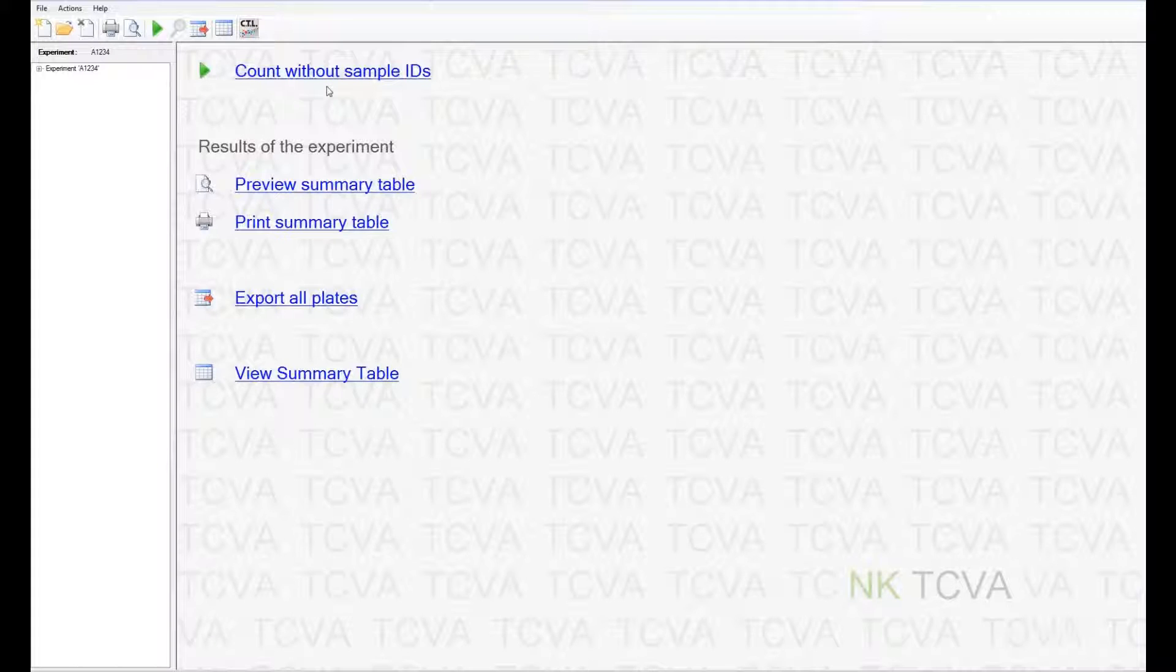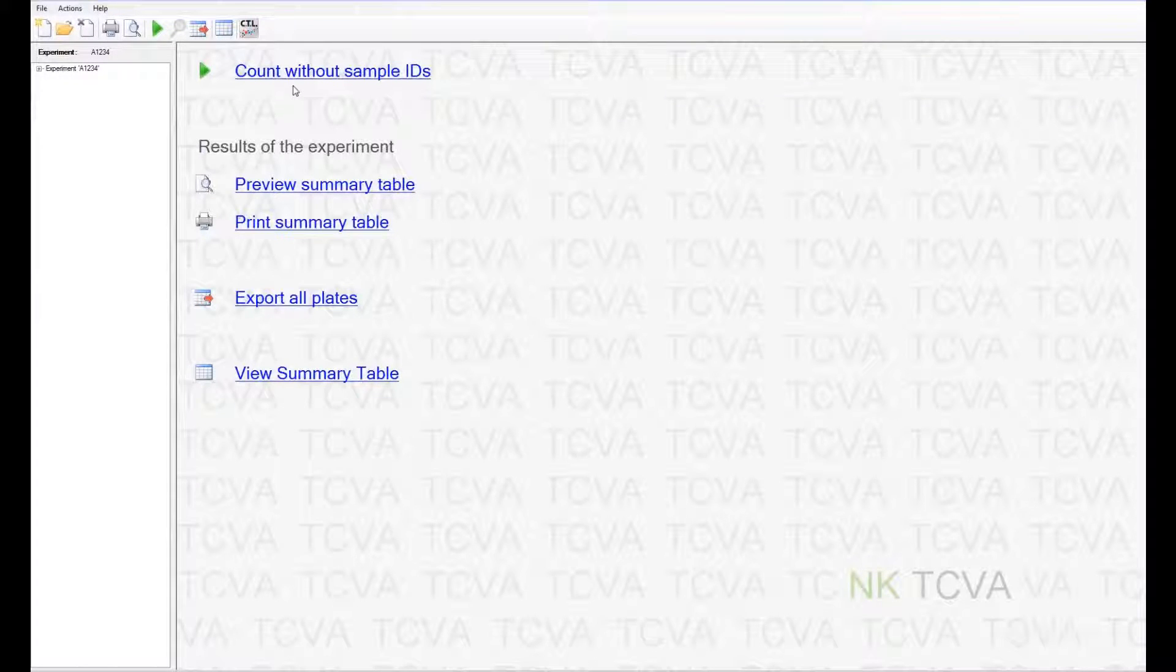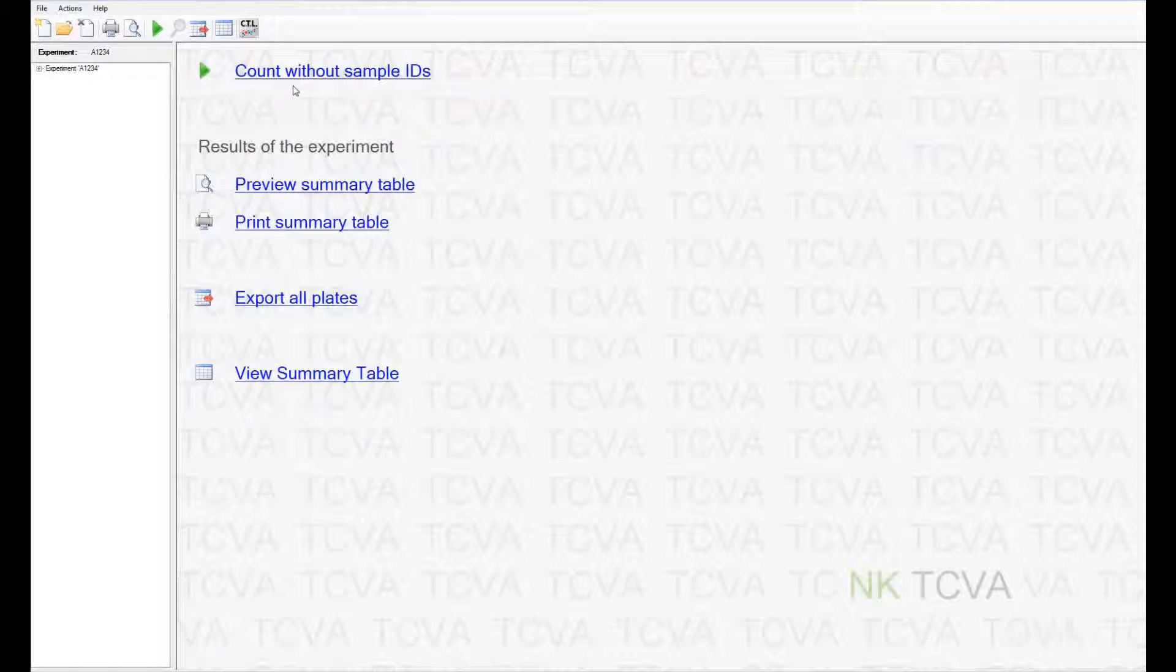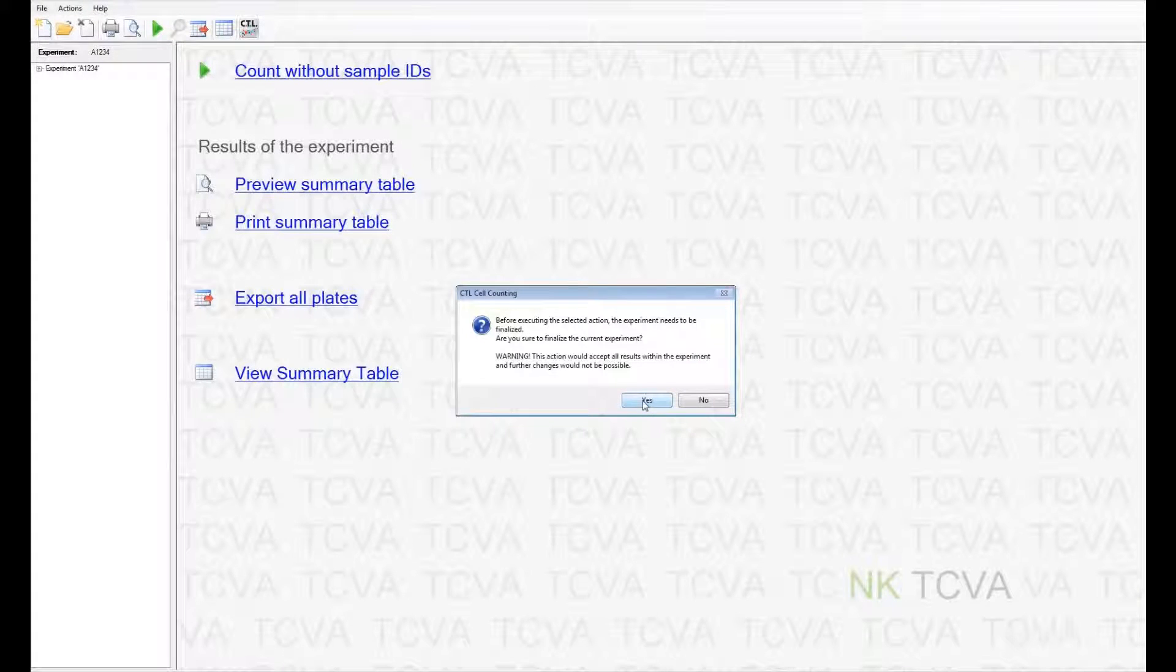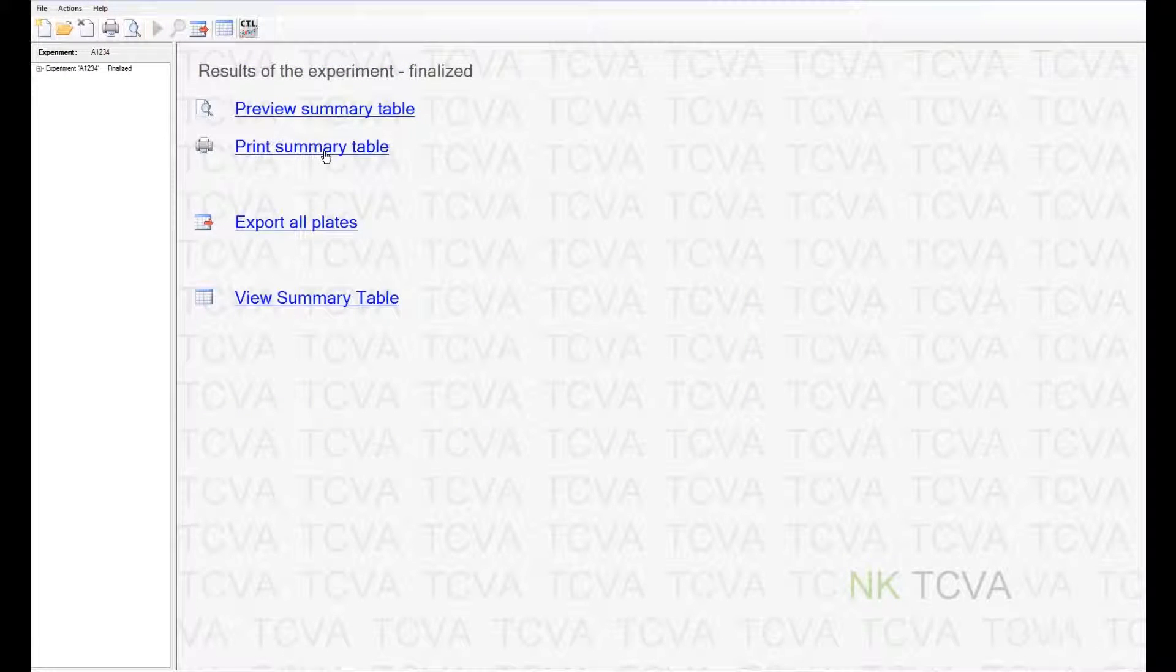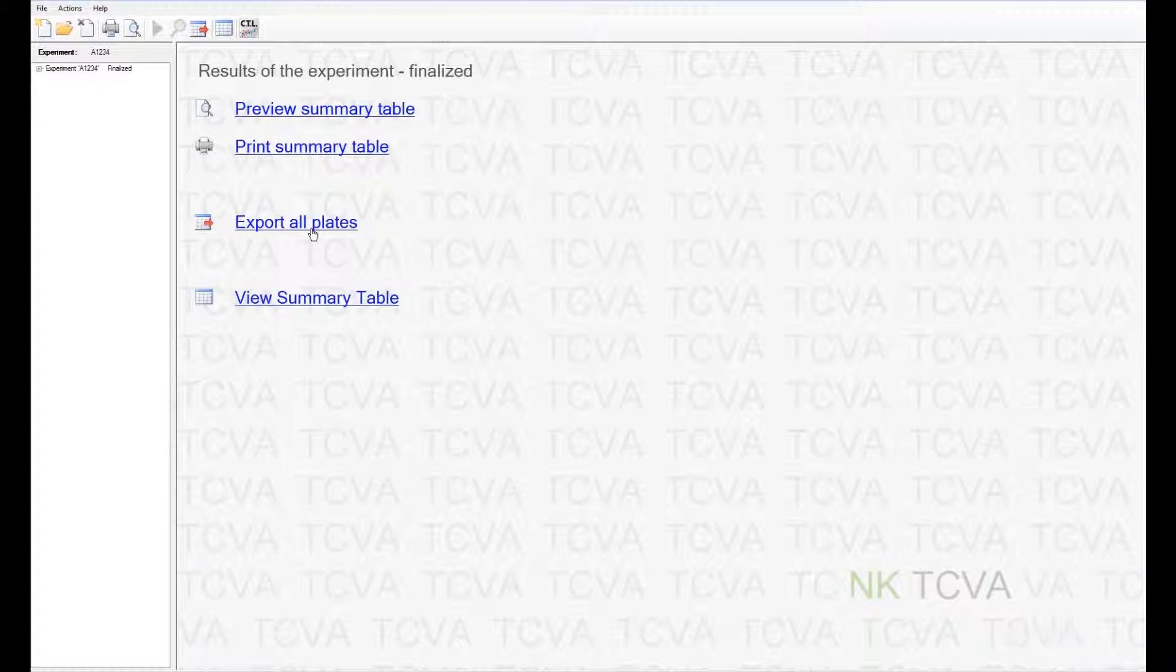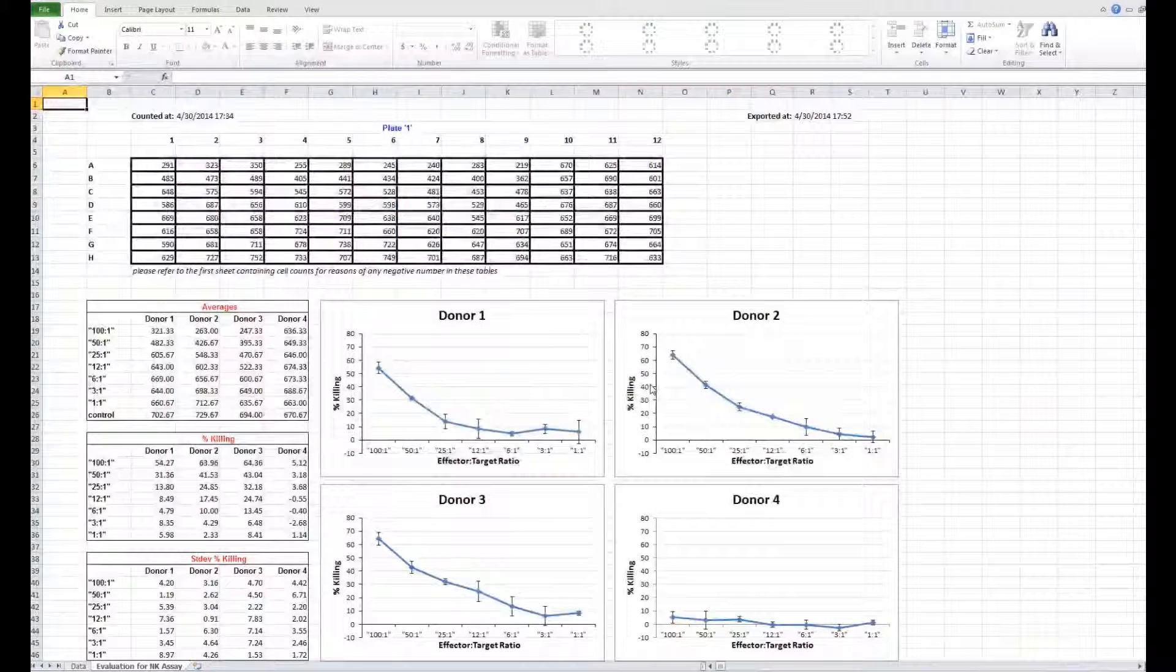To add more samples, use the count without sample IDs icon and repeat everything you just did. You can also preview the summary table after finalizing the plate. You can also print the summary table one more time. You can also export the data onto an Excel sheet for future purposes.